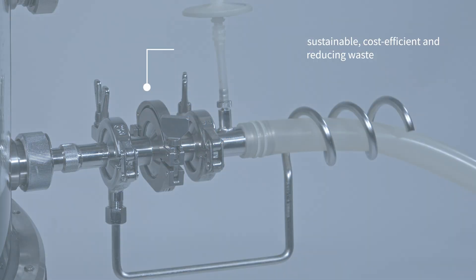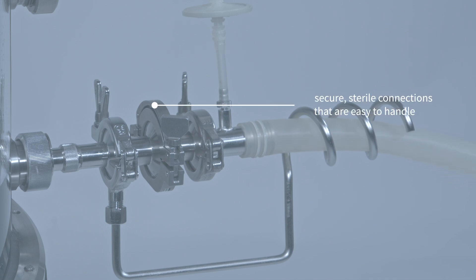Zeta EcoConnect, our innovative aseptic connector designed to enhance your processes by reducing waste and optimizing cost efficiency.